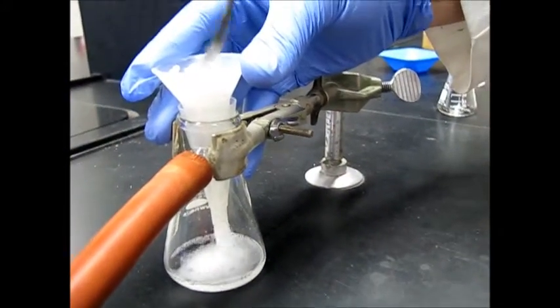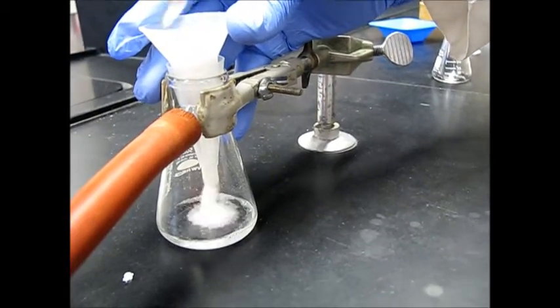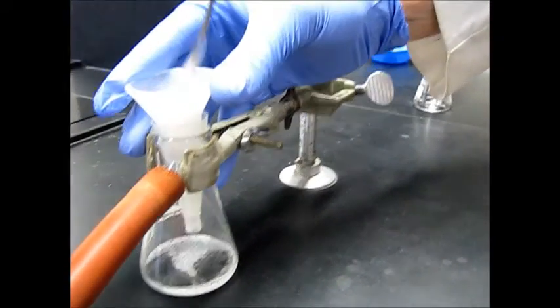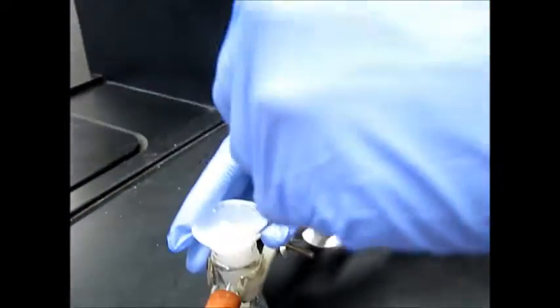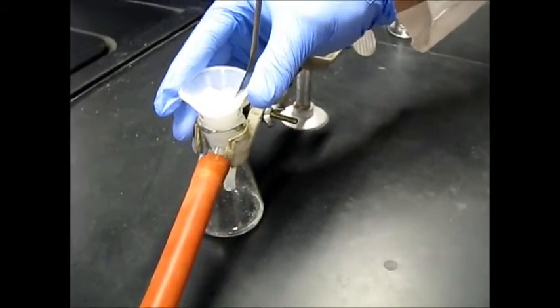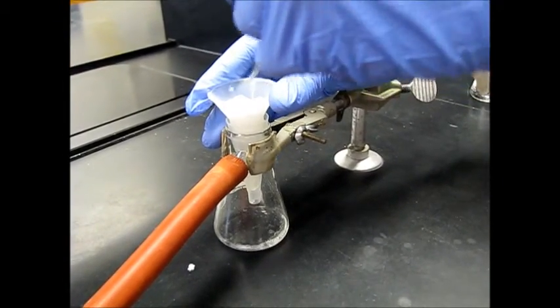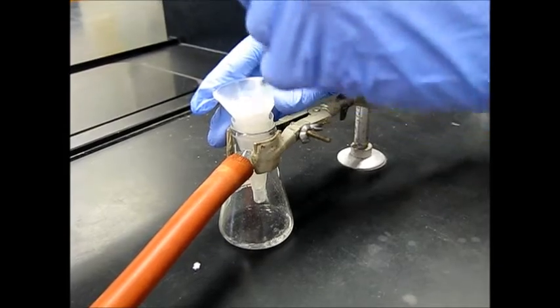See there, we get a nice... All that stuff is probably mostly HCl, a little bit of water, and maybe some ethanol as well. So we're going to want to make sure we press this dry. Once it's sat under vacuum for about 2 more minutes, we'll add that 2 milliliters of cold methanol to really help it rinse.